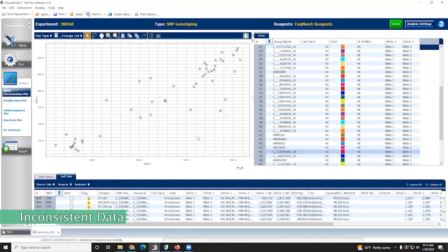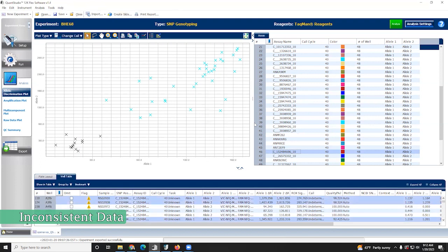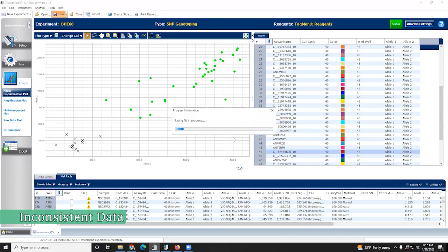Here we can see a data set in which there's basically just one group of genotypes. So this is probably all one group of people. Again, it's not super clean, but this is just the nature of the microchip. So the most likely thing is that these are heterozygotes, as opposed to them being all one of the homozygotes, especially looking at the way that it's distributed.